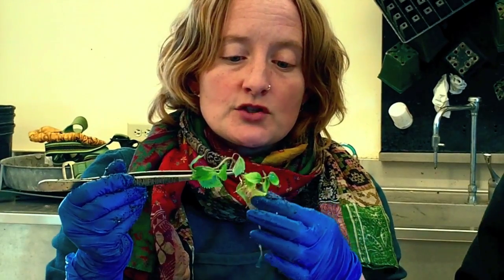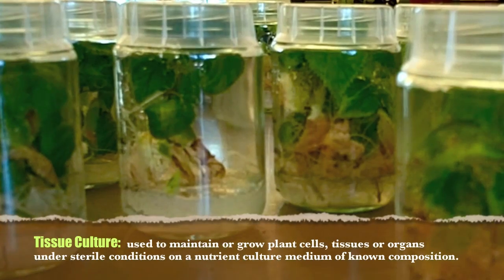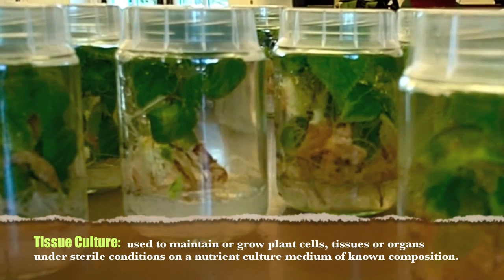Right now we are just transferring these guys. They've grown in tissue culture, and we are outplanting them for the first time to see if we can get some healthy, vigorous ones.